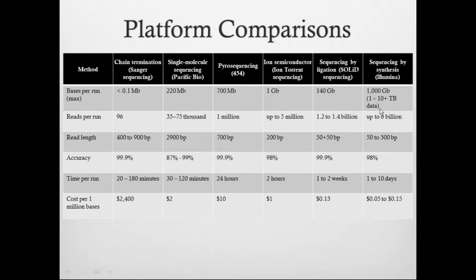And so that was the basic limitation. But then came along what we call next-generation sequencing. This is Illumina. There are others that are also used. Now you have a chip like this, and you put your samples on this chip. On the chip, you can put, in essence, millions of separate sequences of DNA, and every sequence is read. That is, every sequence is sequenced. We determine the sequence of every single one on that chip.